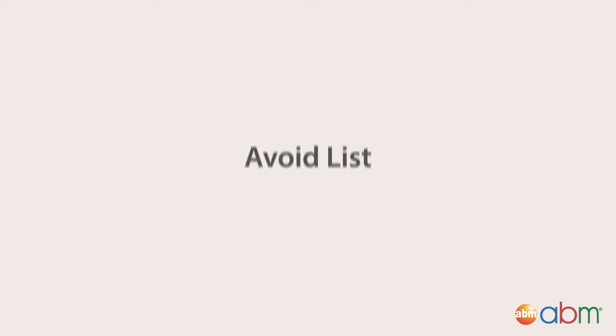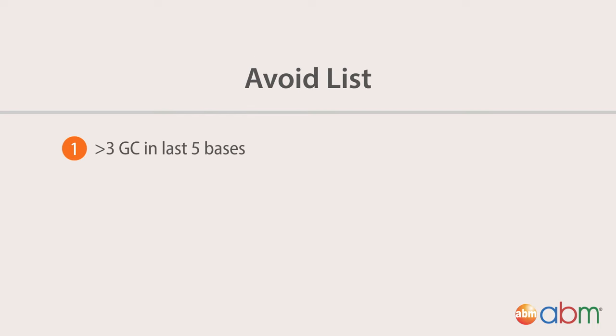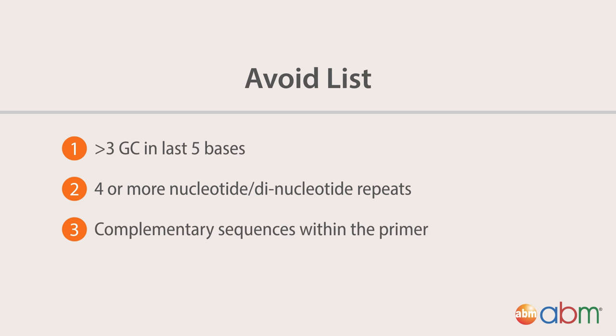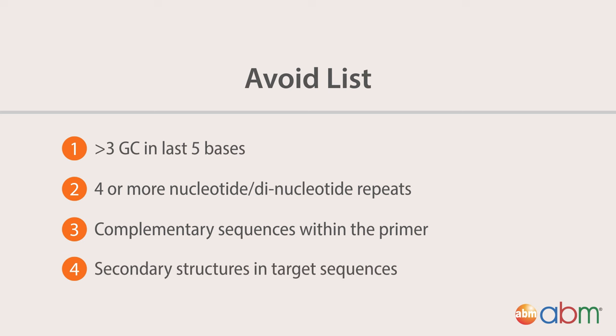And here is a list of what you should avoid. Make sure there are no more than 3 GCs in the last 5 bases of the primer. Avoid having more than 4 nucleotide runs or dinucleotide repeats. Ensure the designed primers do not form self-dimers or primer dimers. And lastly, avoid designing primers targeting secondary structures in the template.